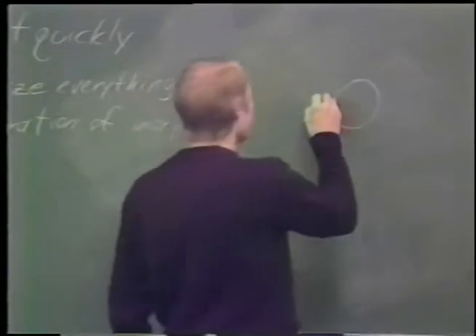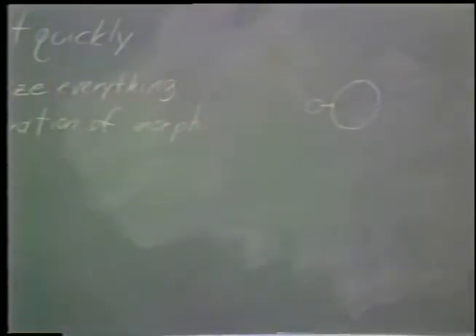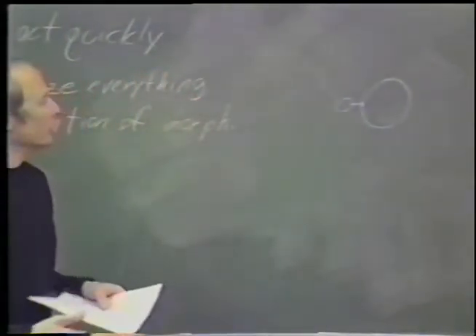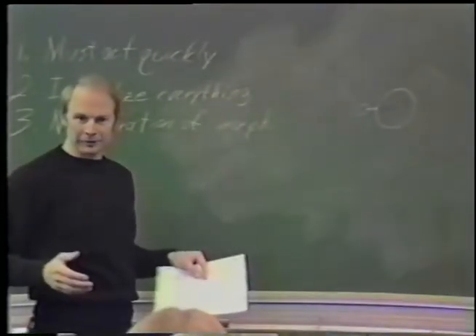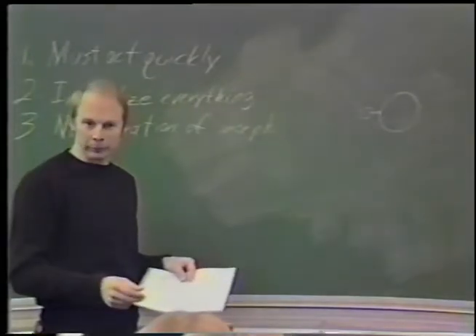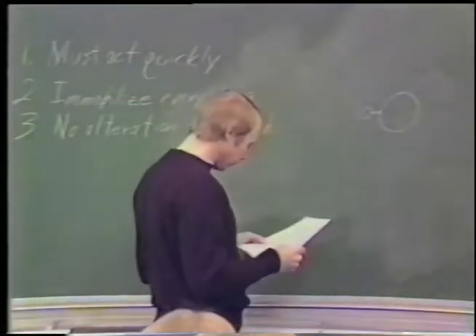So it's more energetically favorable for these water molecules to move over here to the larger ice crystal. So you can ultra-rapidly freeze a sample, warm it, and keep it warm for too long. Then you'll get severe ice crystal damage. So you have to be very careful when you're working with samples. Make sure you touch them only with pre-cooled forceps and that sort of thing, to keep this sort of damage from occurring.